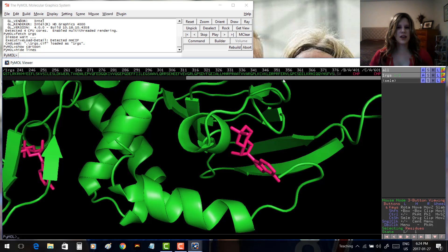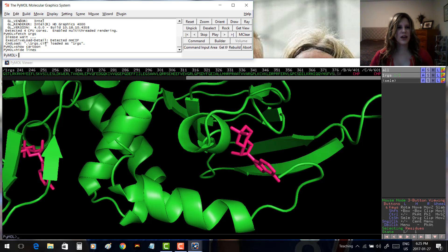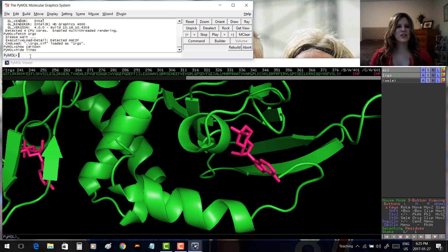Now let's say we're interested only in certain residues, and we'd like to use commands instead. We'll label all of them here, but this would apply if we only wanted certain residues. The command is quite long but gives us exactly what we're looking for, so let's go ahead with it.